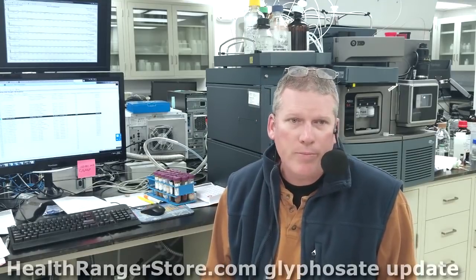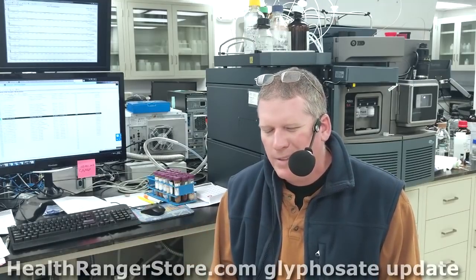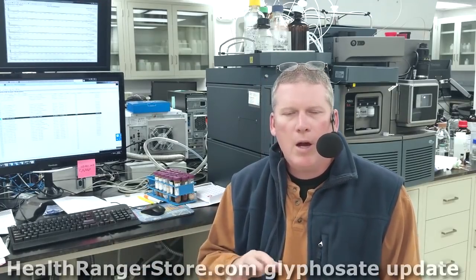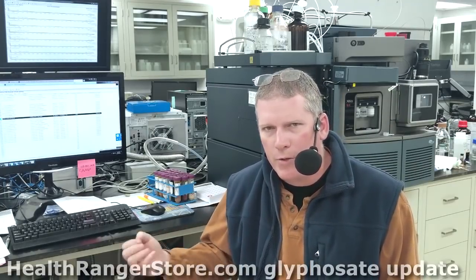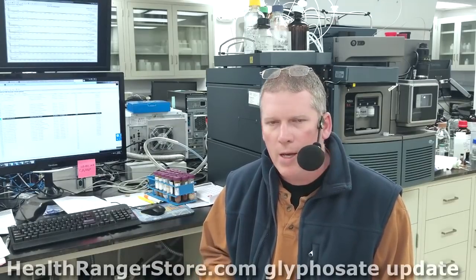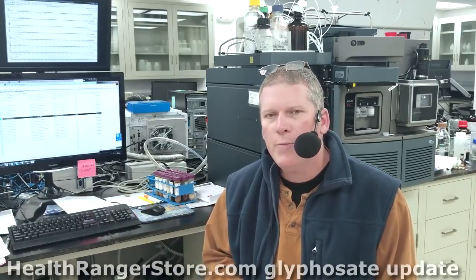It is actually probably, I'd have to check the chromatography, but I think it's around 500 parts per trillion, something in that range. I'd have to check, but it's below 1 part per billion. Our limit of quantitation on this instrument using this chemistry and this method and the dilution factor that we have for sample prep and so on, the limit of quantitation is between 1 and 2 parts per billion.